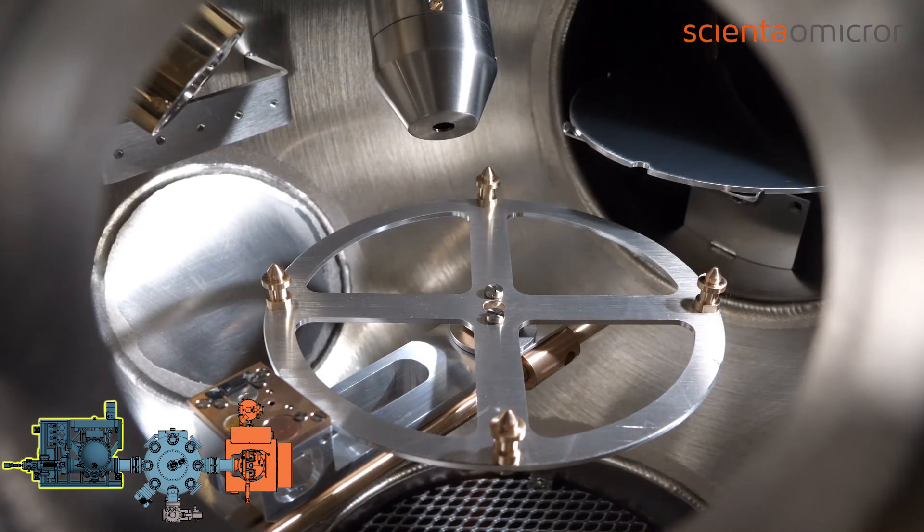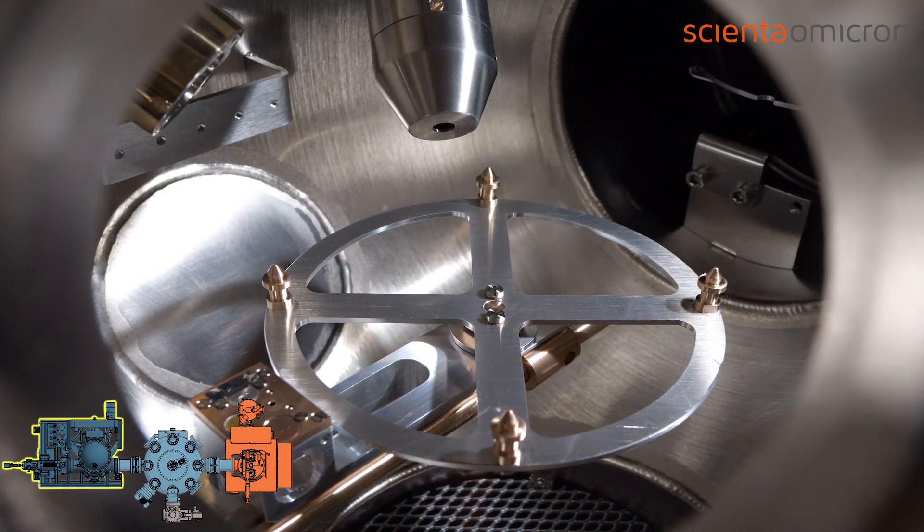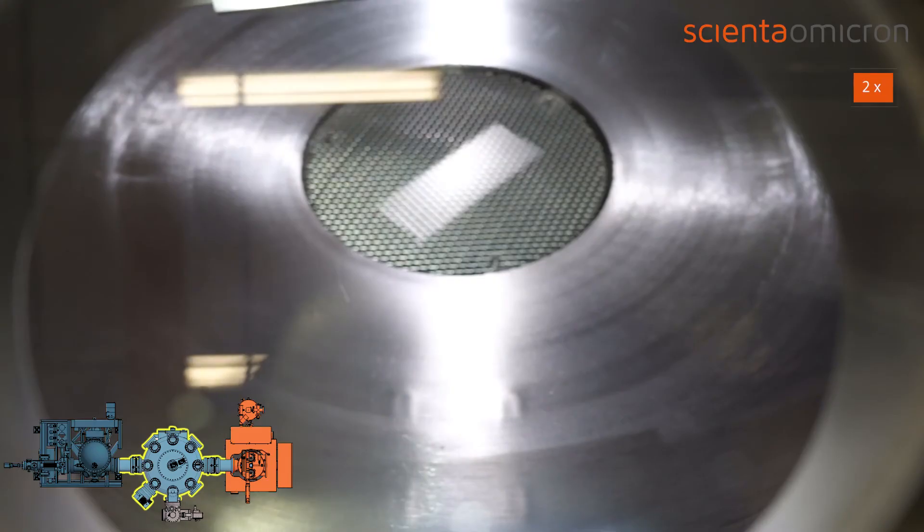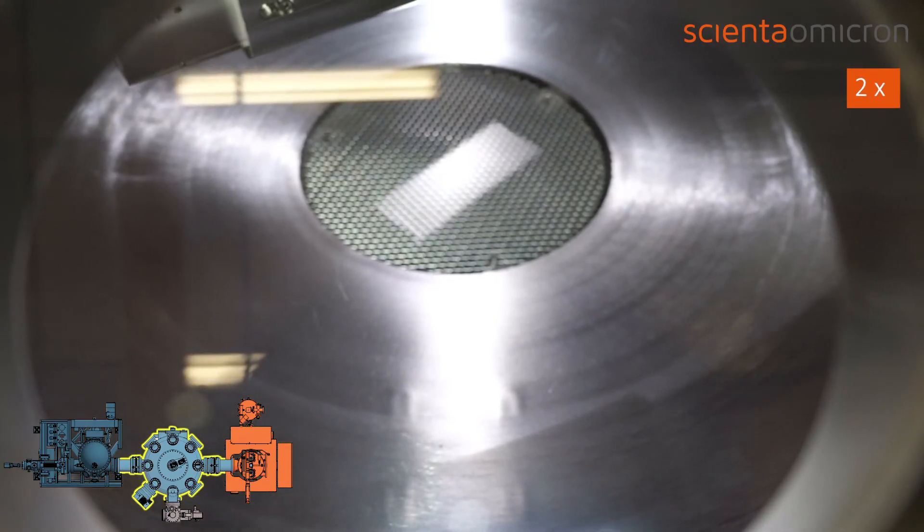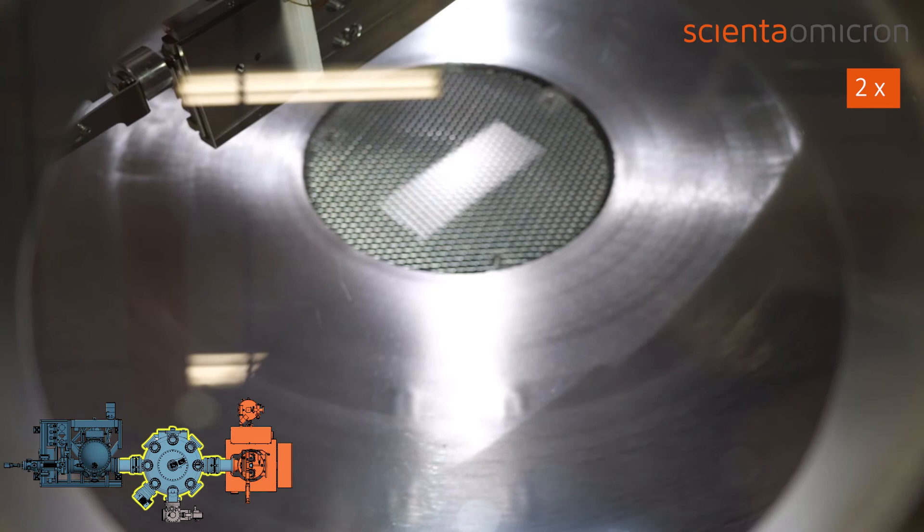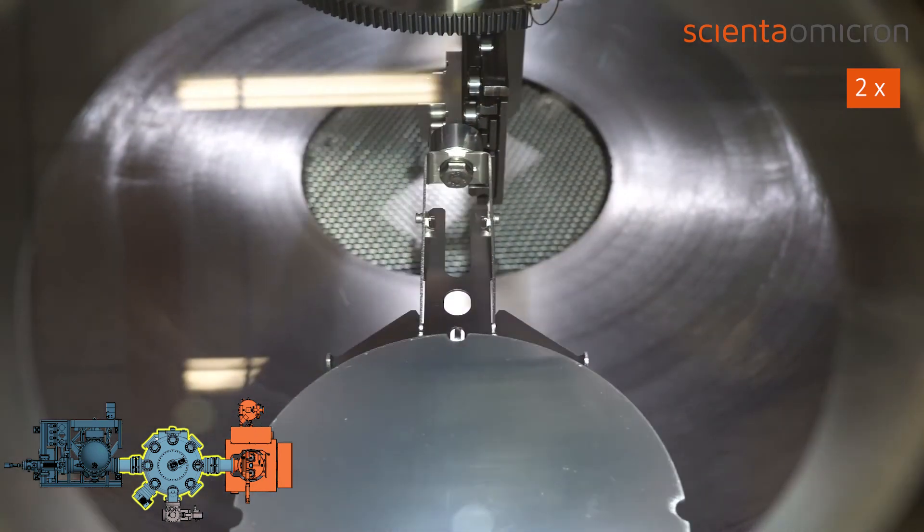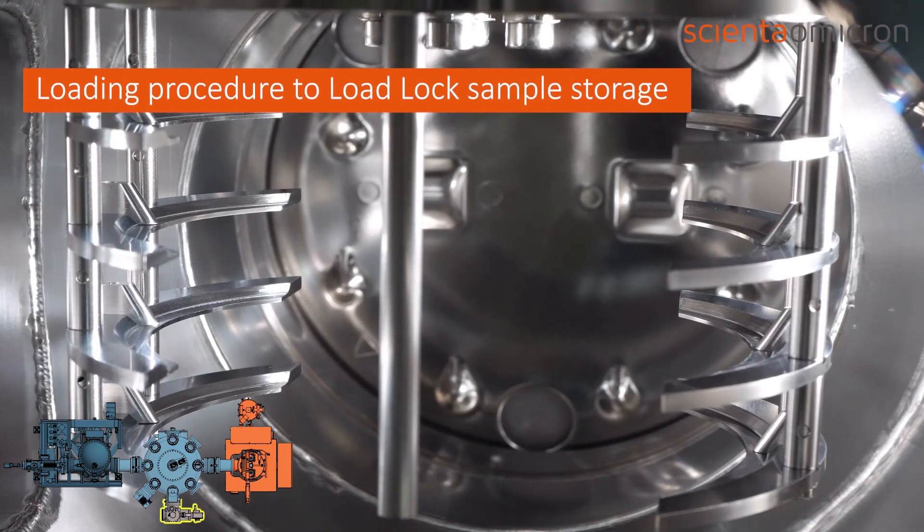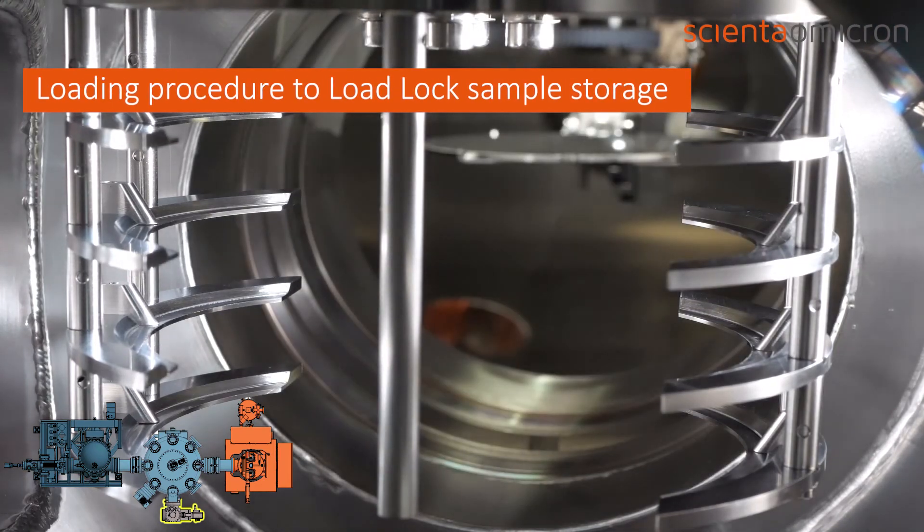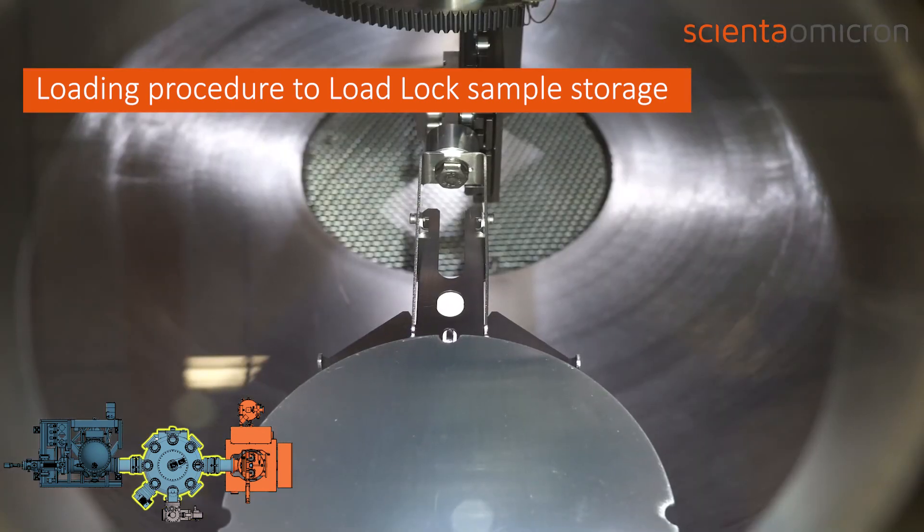The last transfer procedure demonstrates how the wafer holder is loaded to the sample storage in the load lock. After initializing the sample loading process, the robotic arm rotates towards the connection flange to the load lock. When the robotic arm is in position, the UHV gate valve opens, and subsequently the arm extends into the load lock chamber.